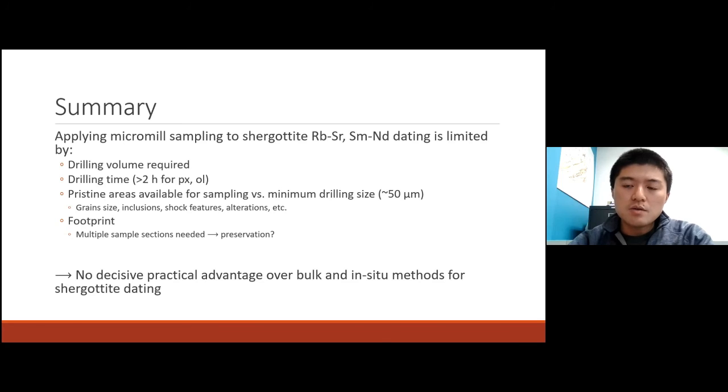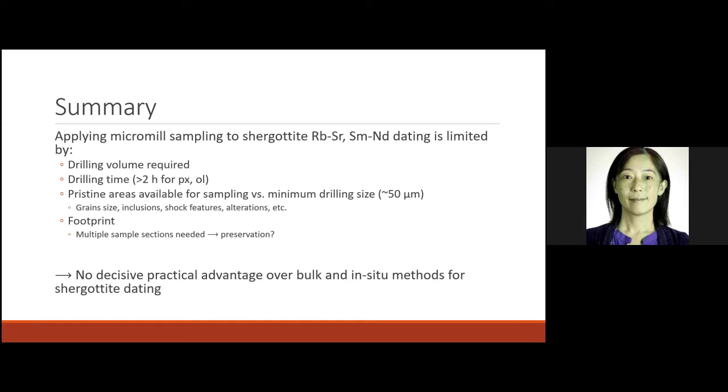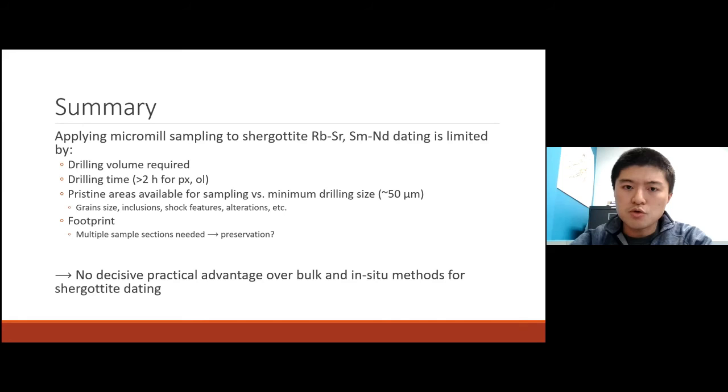One thing I also wanted to highlight here is the uncertainty in the Z, the vertical direction, which is one of the reasons why, in drilling for isotopic analysis on this scale, the drilling depths are usually pretty shallow.